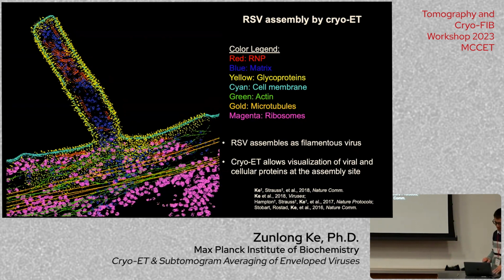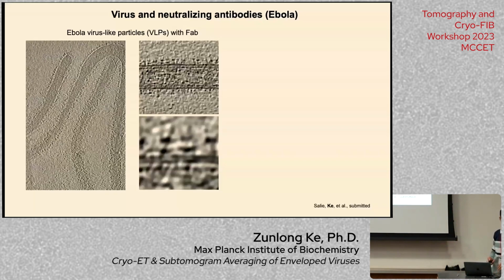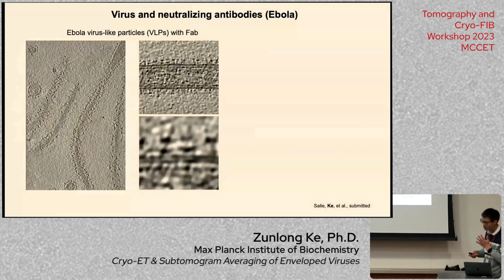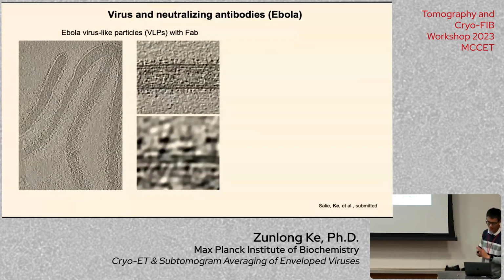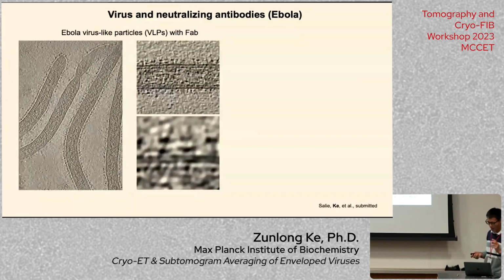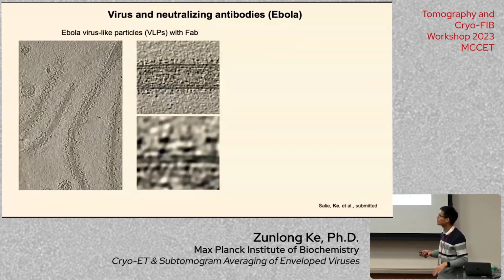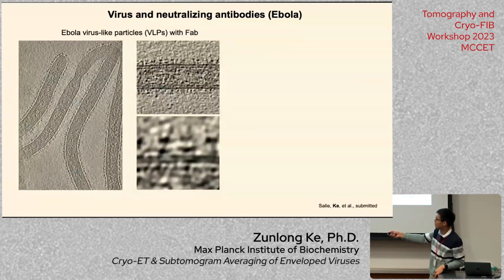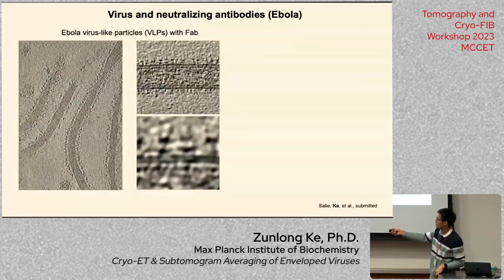Okay. So that's the end of it. Well, it's not the end of it. I will show you two more examples about another two projects I took. So this is the Ebola virus filamentous particles. You can see this super filamentous, and you can see the glycoproteins coming out of it.